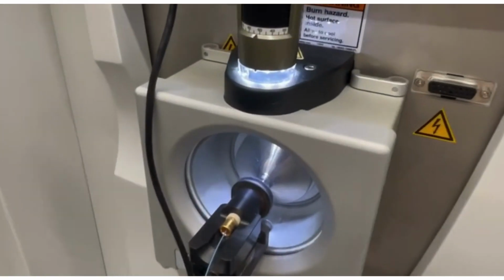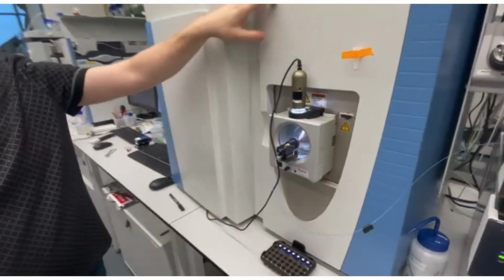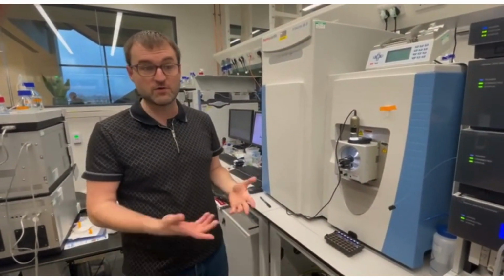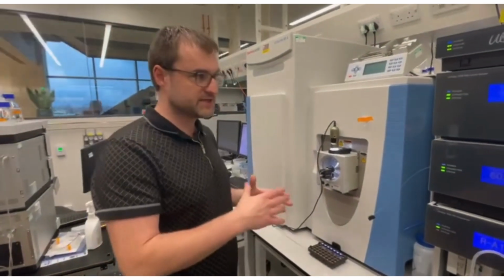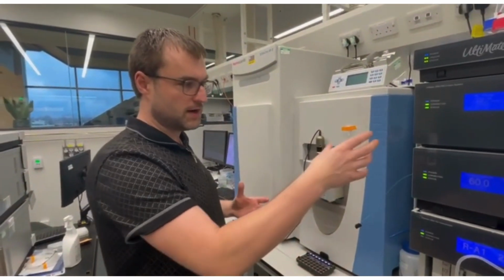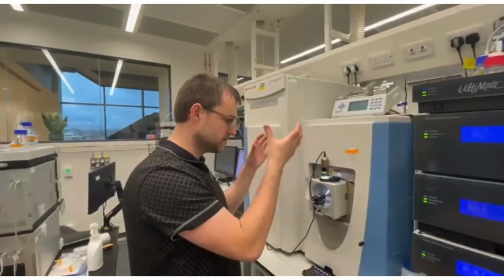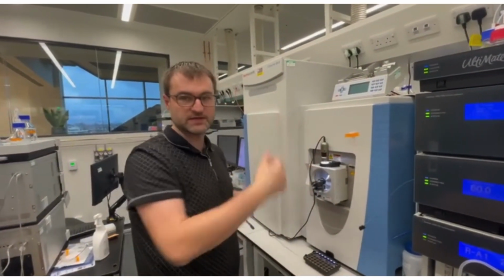The process of electrospray ionization is one of the most important discoveries in chemistry, and one of the most famous Nobel Prizes was awarded for it, for finding a method to get ions from a liquid mobile phase into vacuum through an interface.